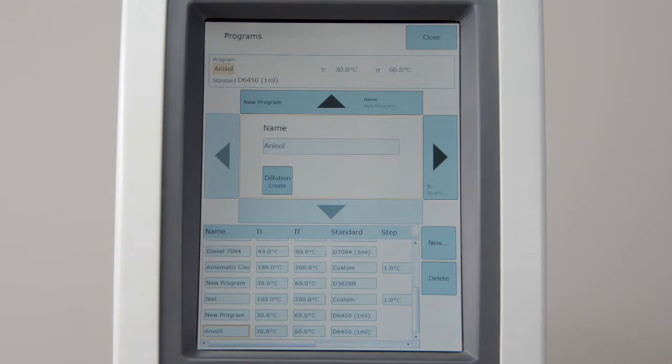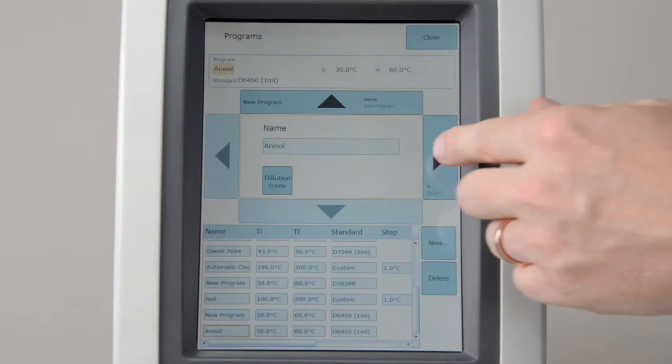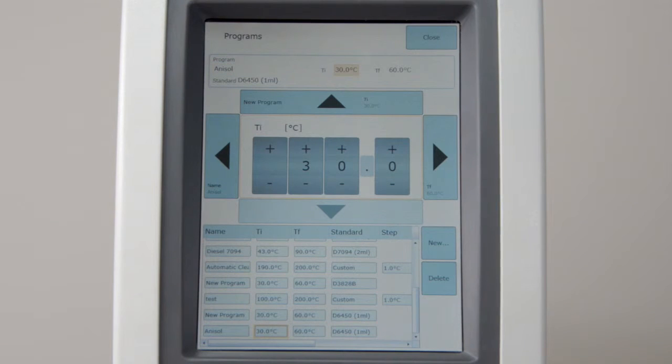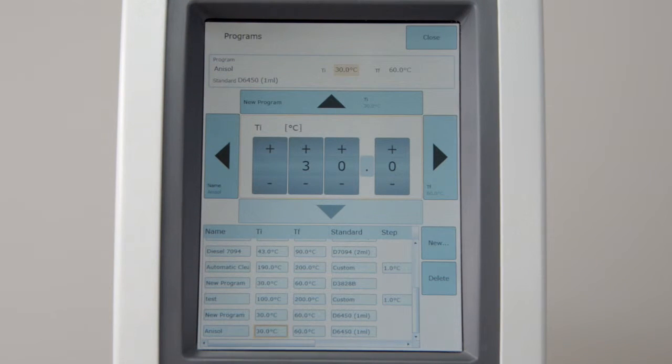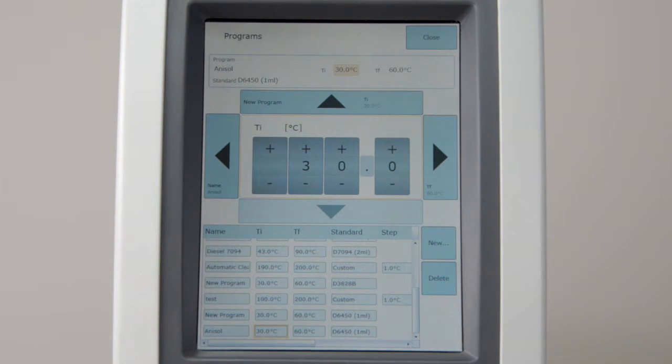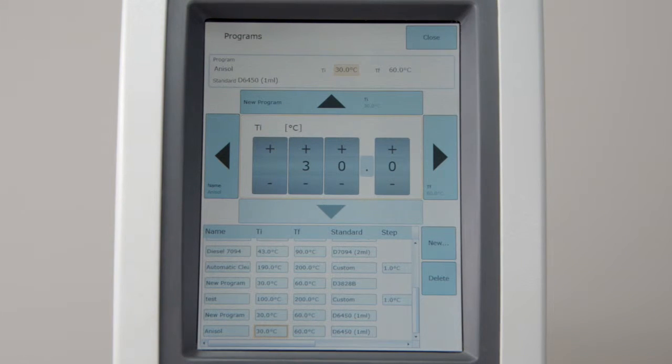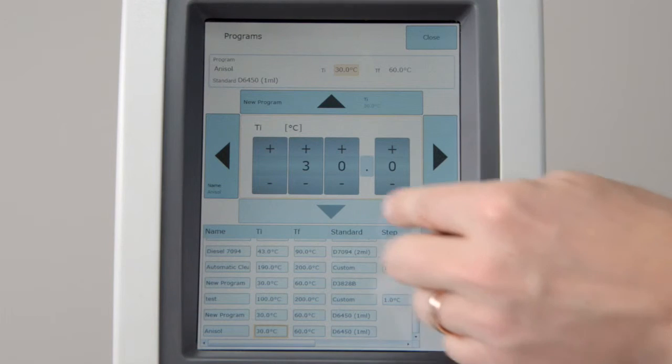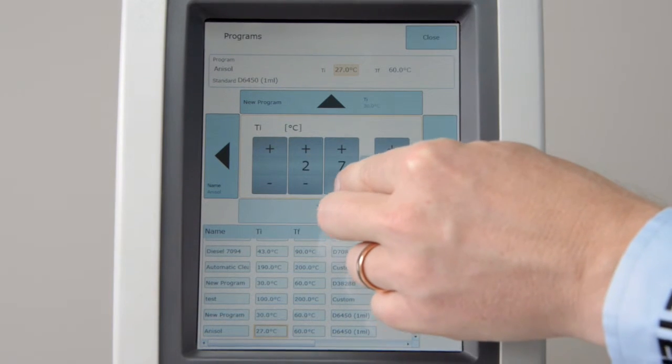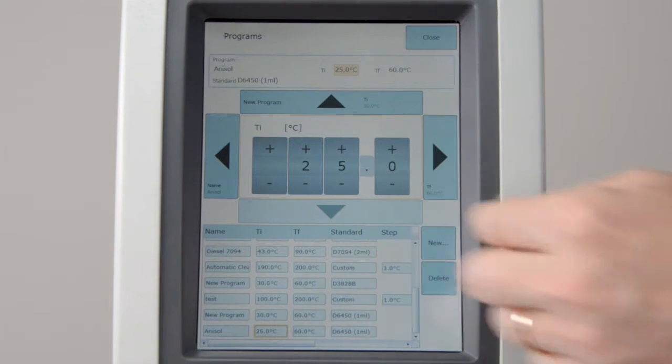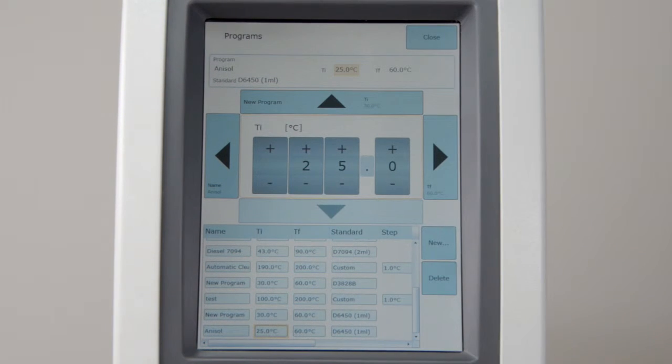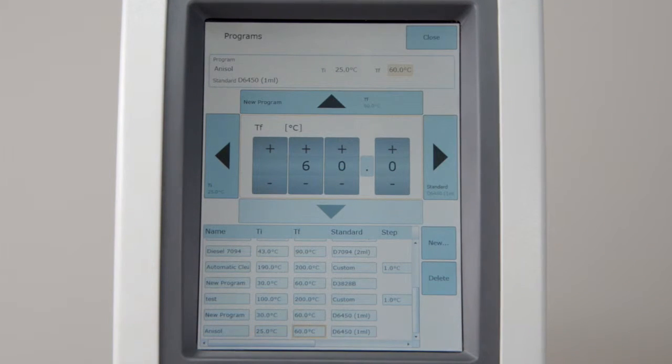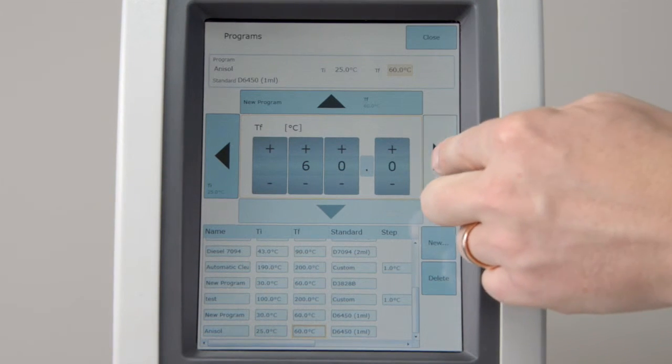Set the initial temperature, TI. Per standard, the start temperature must be 18 degrees Celsius below the expected flash point. Anisole flashes around 43 degrees centigrade, so reduce the initial temperature to 25 degrees centigrade. Set the final temperature well above the expected flash point.